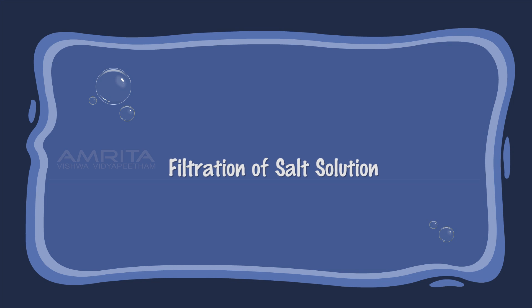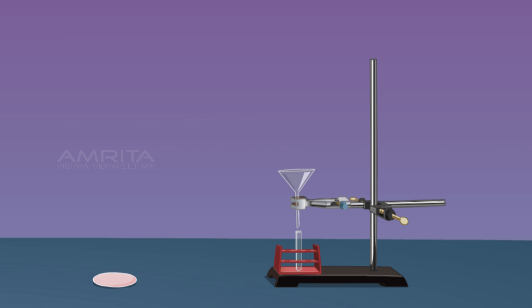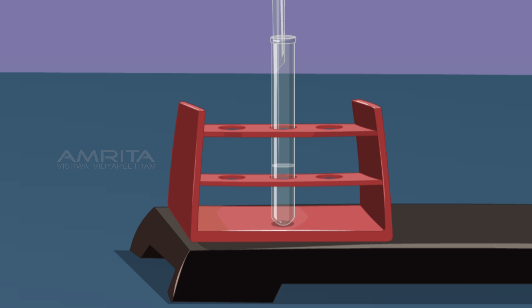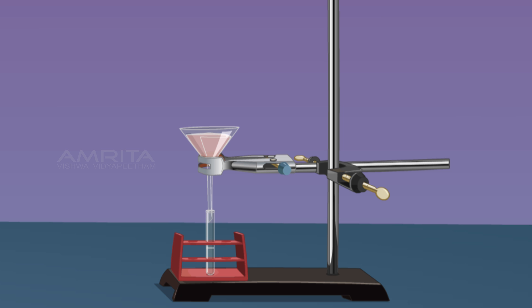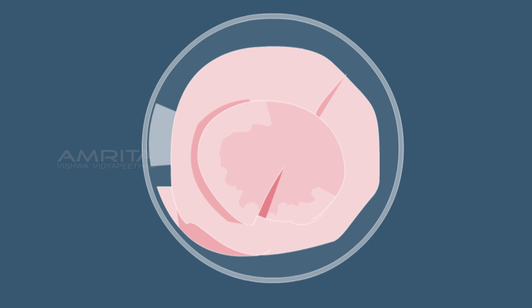Filtration of Salt Solution: Place a funnel over a test tube using a clamp stand, then place a filter paper in the funnel. Now pour some salt solution through the funnel. A clear filtrate is obtained with no residue left on the filter paper. This indicates that solid particles cannot be separated from a true solution by filtration.